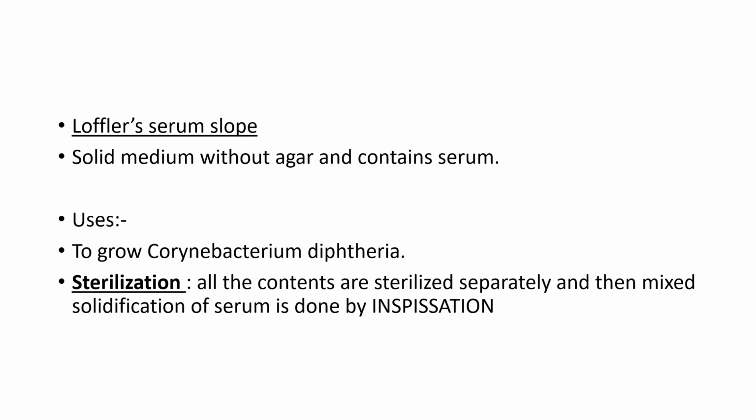Now we will discuss the Loeffler serum slope. It is a solid medium without agar and it contains the serum which acts as a solidification agent. It helps to grow Corynebacterium diphtheriae. For sterilization, all the contents are sterilized separately and then mixed. Solidification of serum is done by inspissation. So inspissation helps in the solidification of a media.